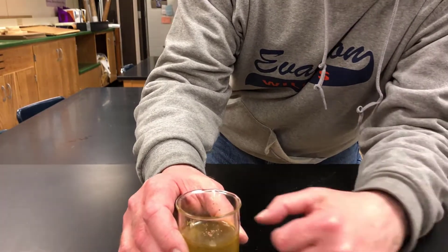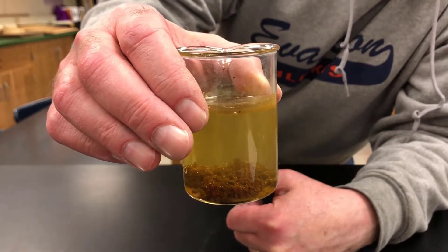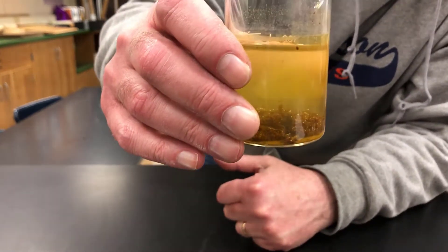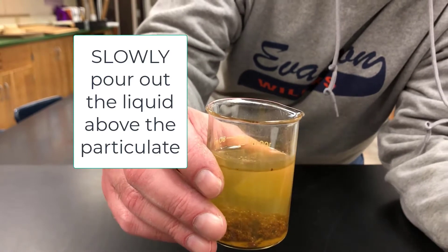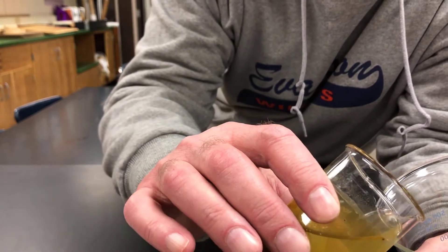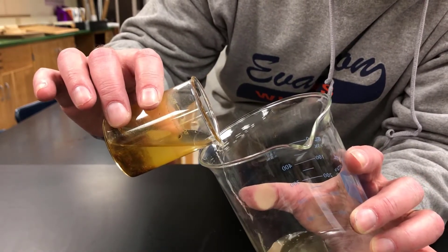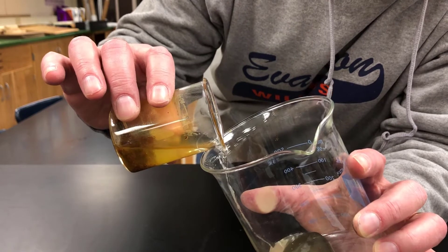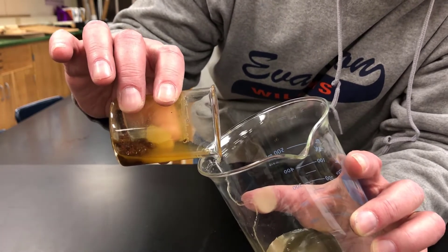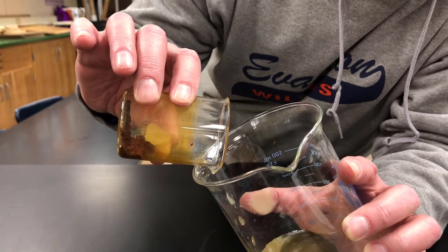Decanting is when you want to separate particulate matter that's sitting at the bottom of a vessel from the liquid sitting on top of it. Once the particulate has settled, you pour very, very slowly so as not to disturb it. You always pour into another container instead of the sink, because if you do lose any of the particulate you want to save, you have it to recover in the other beaker. I'm not losing any of that reddish brown material — that is the material I want to keep.